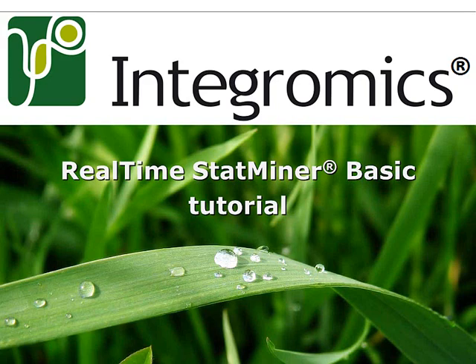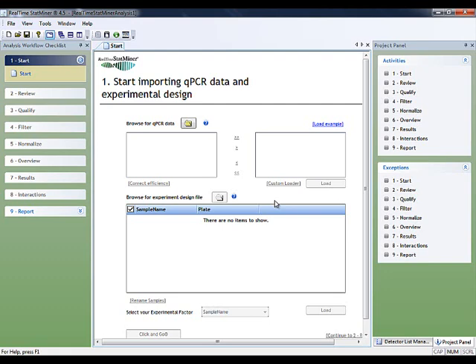Welcome to the video tutorial on how to use the standalone application for StatMiner. This tutorial will briefly show you how to work with StatMiner, like loading an example dataset, preparing the experimental design, and finally getting differential expression results based on default analysis settings.